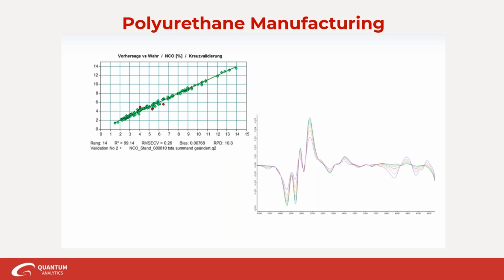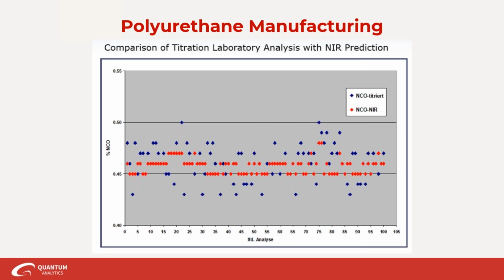and you see that this one worked pretty beautifully as well. And to prove that to you, what we have here is a plot of a comparison of the values of samples from the titration and laboratory analysis versus the near-infrared prediction from the spectra that was collected during the reaction and the calibration model that was used. So you see they match up pretty well.